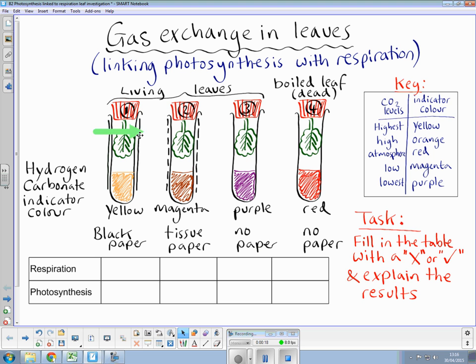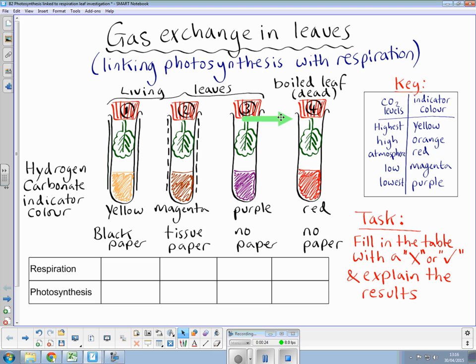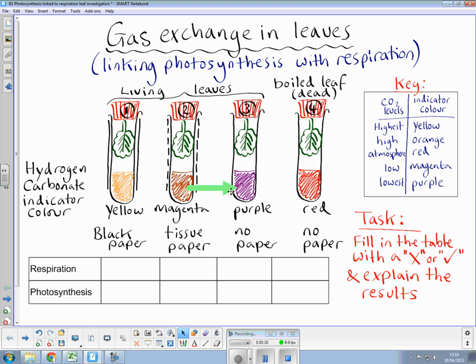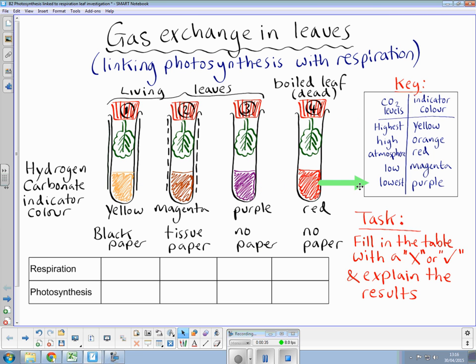The first three tubes, one, two, and three, have leaves that are living, and unfortunately this poor little chappy here has been boiled, so it is dead. At the bottom of the tubes, you can see a hydrogen carbonate indicator, which does change colour depending on the level of CO2 present, and we have this key here on the right-hand side.